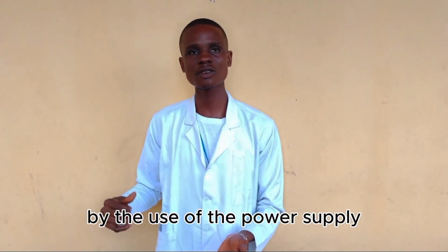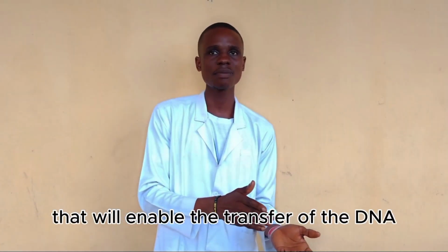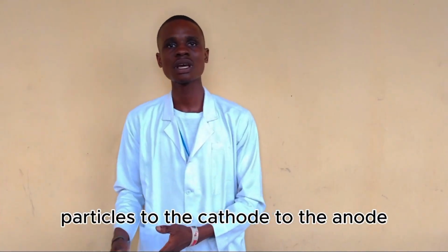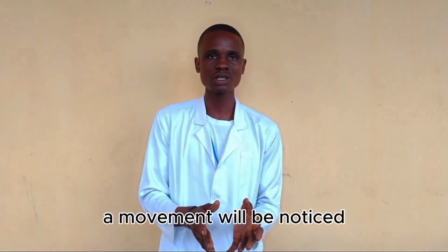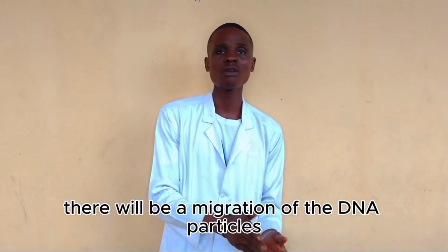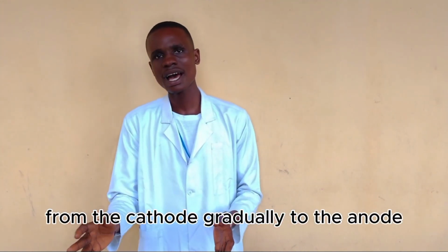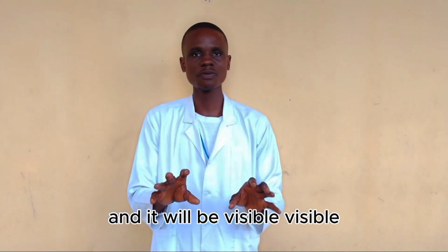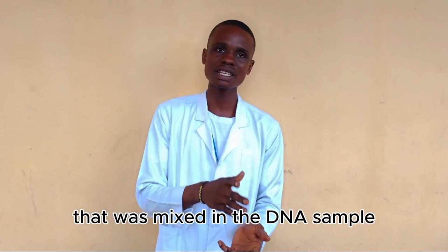Now, when the gel tank is covered, voltage will be introduced into the gel tank by the use of the power supply, which will generate electric current that will enable the transfer of the DNA particles from the cathode to the anode. And once the voltage is introduced, a movement will be noticed. There will be a migration of the DNA particles from the cathode gradually to the anode, and it will be visible by the help of the tracking dye that was mixed in the DNA sample.